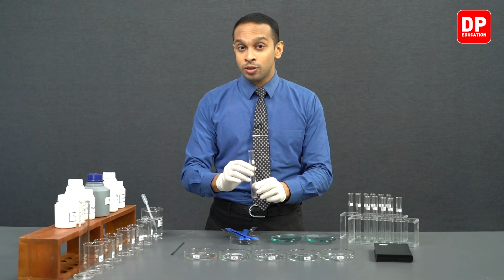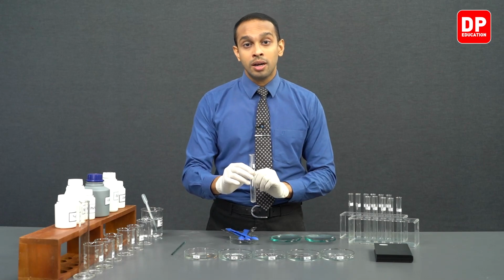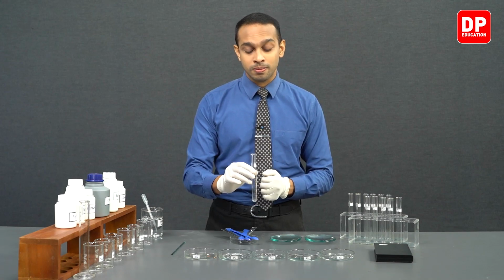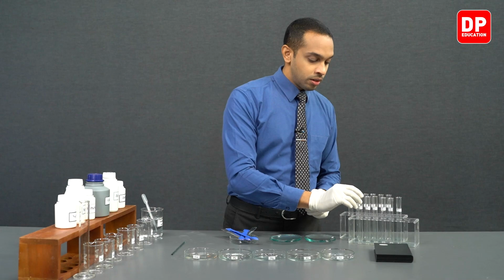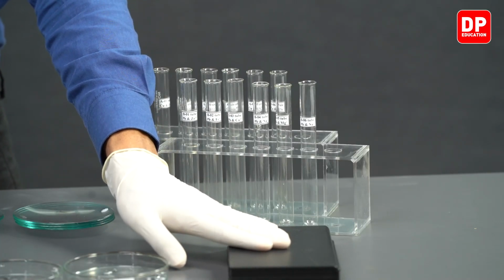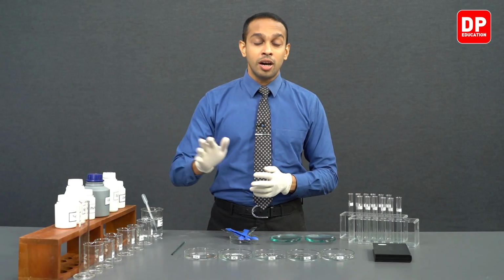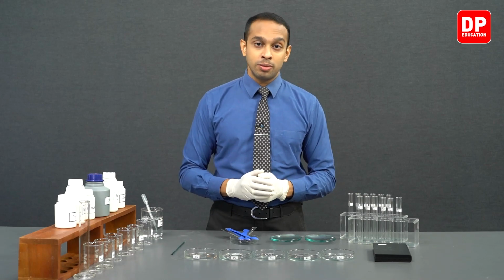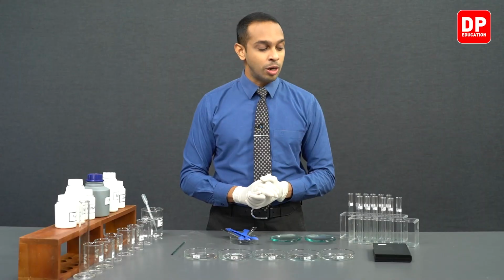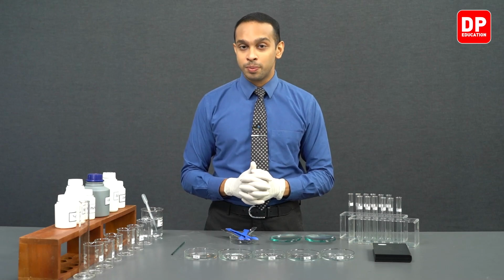So in other words, to a portion of zinc sulfate solution, we are going to add a lead metal piece and observe whether there's going to be any displacement reaction. Then we have a digital balance over here that we'll be using to measure the right masses of these solids when it comes to preparing 1 mole per decimeter cube concentrated solutions of each of these compounds. So now, students, we have identified the chemicals. We can move on to our experiment.